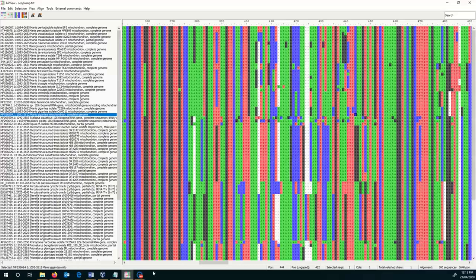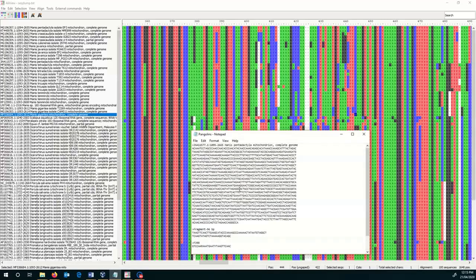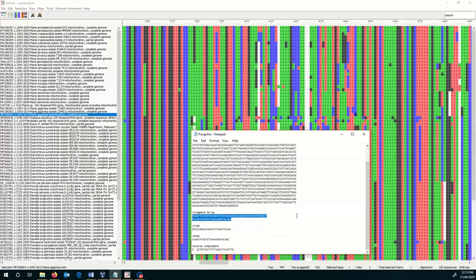So that whole region. So those pairs together, once you've got those sequences, you can search that initial sequence that I cut and pasted out and find where it is. And I did that while I shut off the video, so you didn't have to persist with listening to me do it. But that shows you how long the fragment is. You can cut that out of there, and it's 96 base pairs long. So it's actually a really nice small amplicon. It's got plenty of sequence variation in it that will identify pangolins if we can get pangolin material to amplify from it.